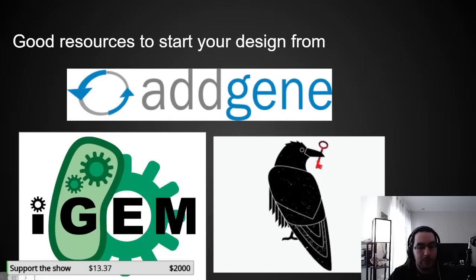The next one is iGEM, specifically BioBricks. iGEM is a genetic engineering competition that happens every year. And as a standard, every team that competes has to submit all the DNA that they used and all of the parts. And they're really good about standardizing the genetic parts that they make. So, for example, they'll have a whole catalog of just promoters. So you can look through their catalog of promoters, find one that does the thing that you want, and then the code is available. You can just copy it and use it in your thing. Or it could be proteins or terminators or whatever. iGEM is fantastic for that.